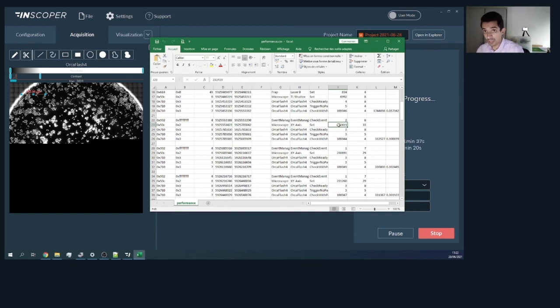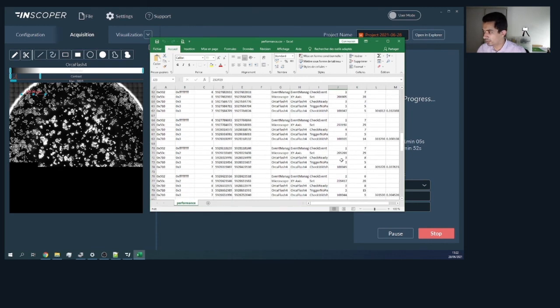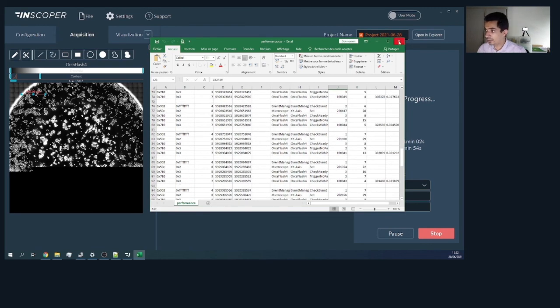from one position to another position. So it's a very powerful file to measure the latency of a microscope, in fact. Here we know that it's fast, and we know that we can also optimize the acquisition speed on our microscope, for example by using a piezo stage, an XY piezo stage. We have that for all the functions of all the devices available on the system. So this is the first example.